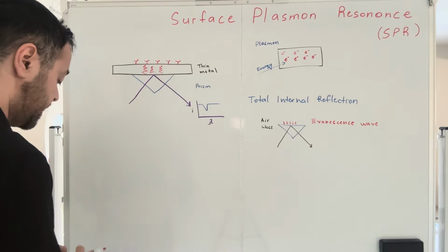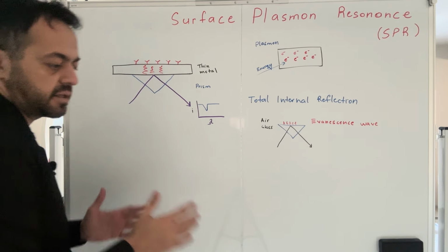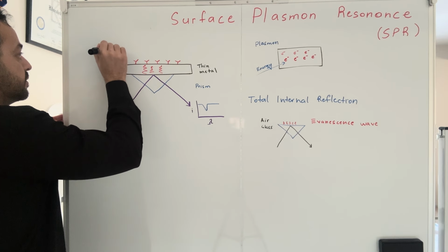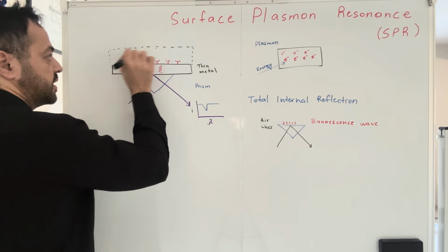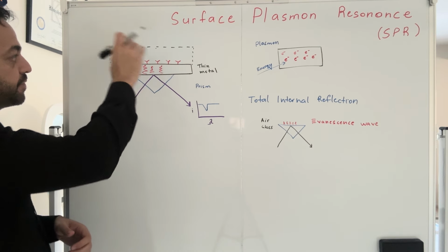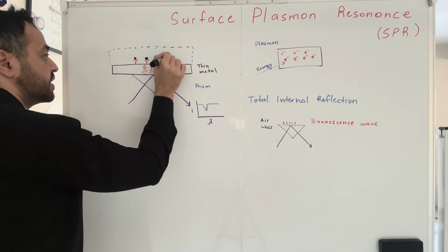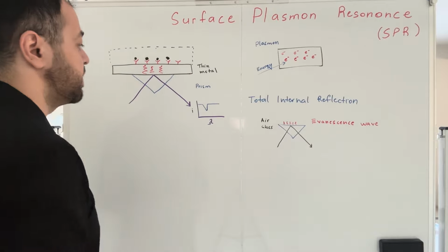So now what happens? Now we apply analyte. Typically this system, sometimes it's built in a microfluidic system. So on the other side, this is the medium, and there might be a buffer or water or something. So now you flush it, and then there's going to be analyte, and they attach on this antibody. So they couple it biologically.